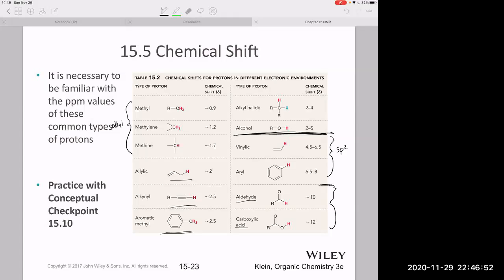One other thing that I would note about an alcohol hydrogen. So this particular group here, first of all, there's no splitting. And again, we'll talk about splitting here in a second, but they'll always be singlets, always just one peak. And they tend to be a little bit broader than most of the other peaks.